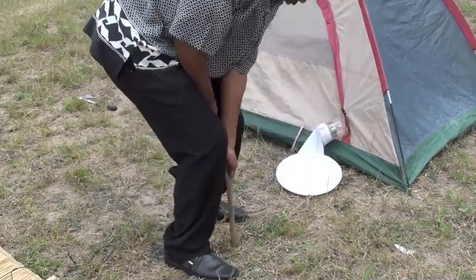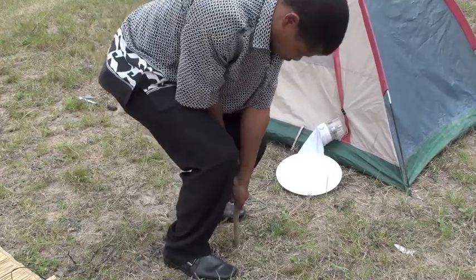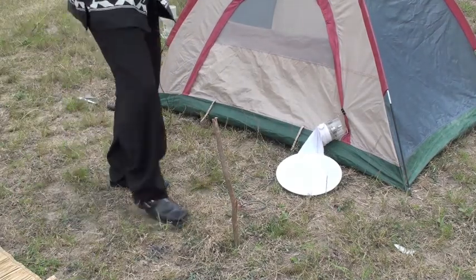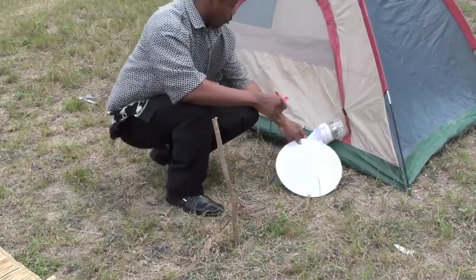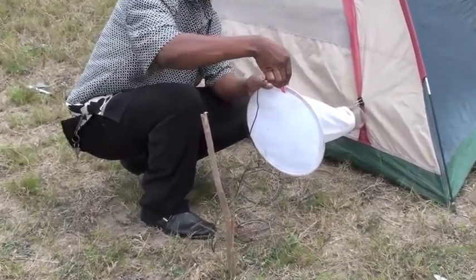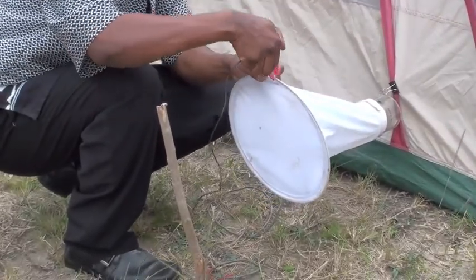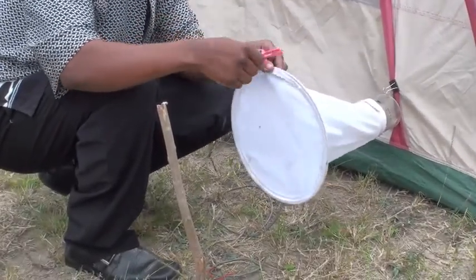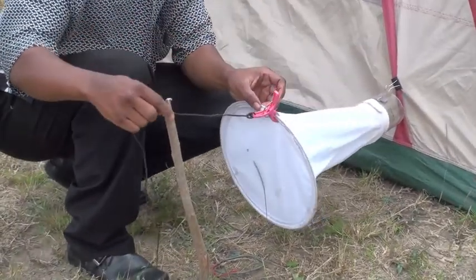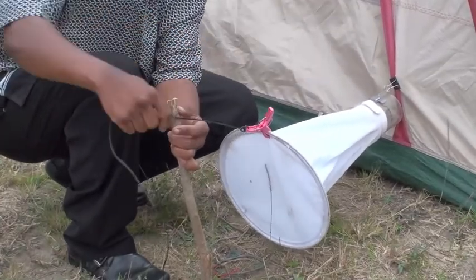This is done by supporting it with a stick and a piece of string and a clip like so. Any clip will do. A bulldog clip is actually better than the plastic peg that we are using for this demonstration.